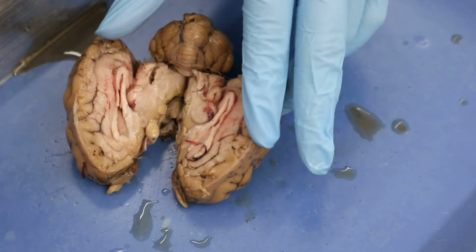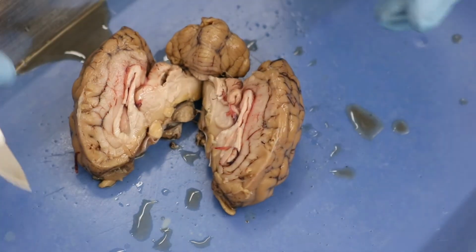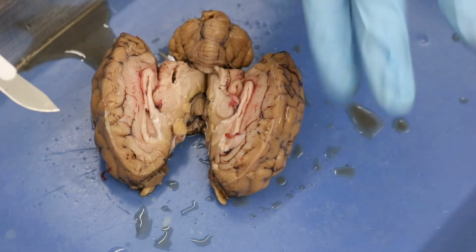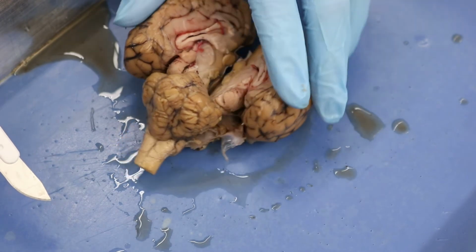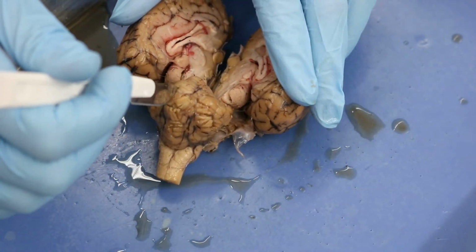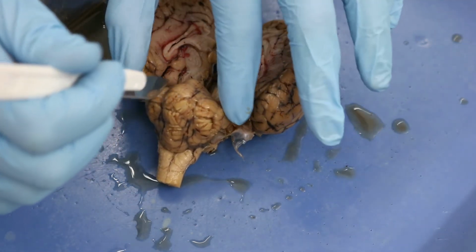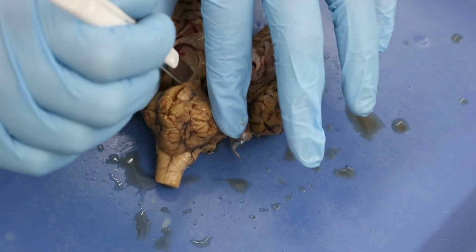So, essentially, we have just cut into 2 halves. All right, so now that we have our 2 halves here, what we're going to go ahead and do, we're going to turn it around, and now we're going to cut through our cerebellum and our brainstem. So again, we're doing smooth, short cuts, okay?